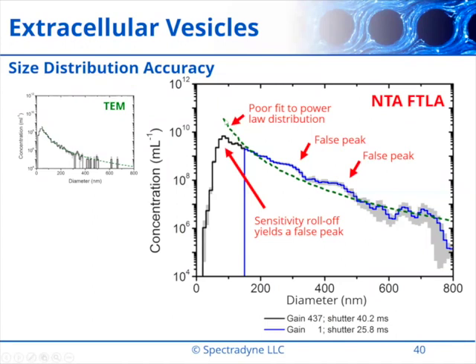the TEM distribution. So with the aggregation, I kind of used the NCS1 as a reference and compared NTA to that. But we're a new technology, so this is interesting because I think we're comparing to a more robust, proven technology, but drawing kind of the same conclusion.